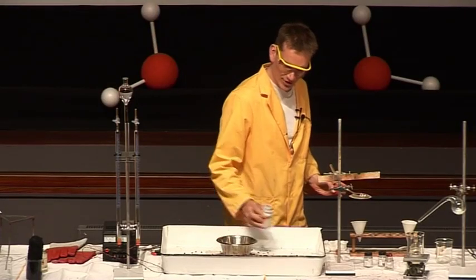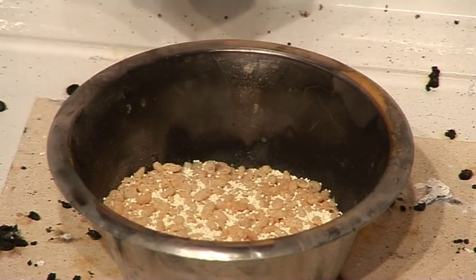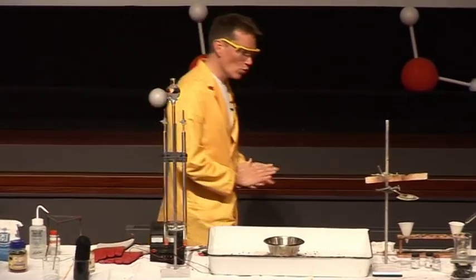Okay, just mix it up nicely. And again, no problem here. So the Rice Krispies are perfectly happy there — nothing's happening until I add some water.